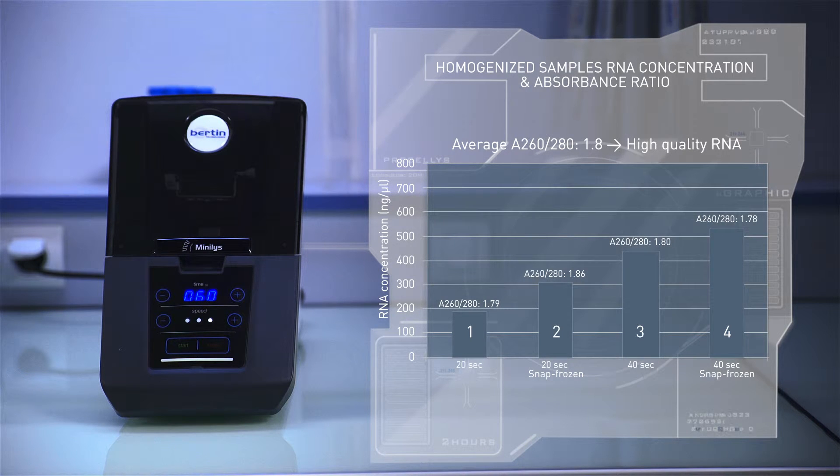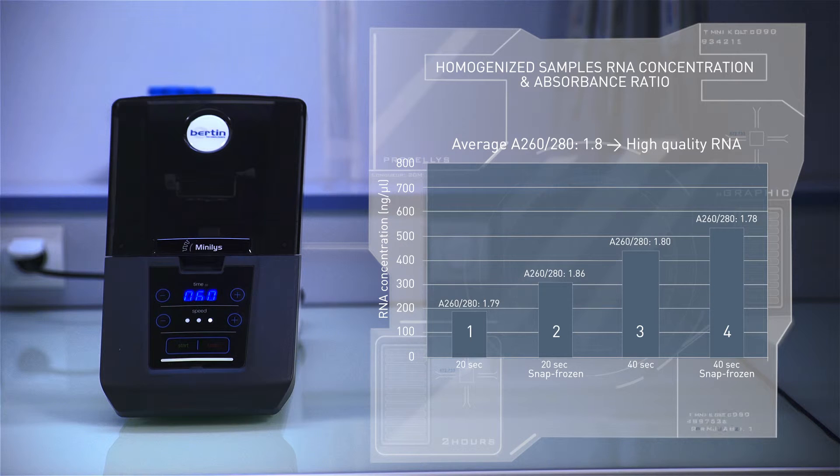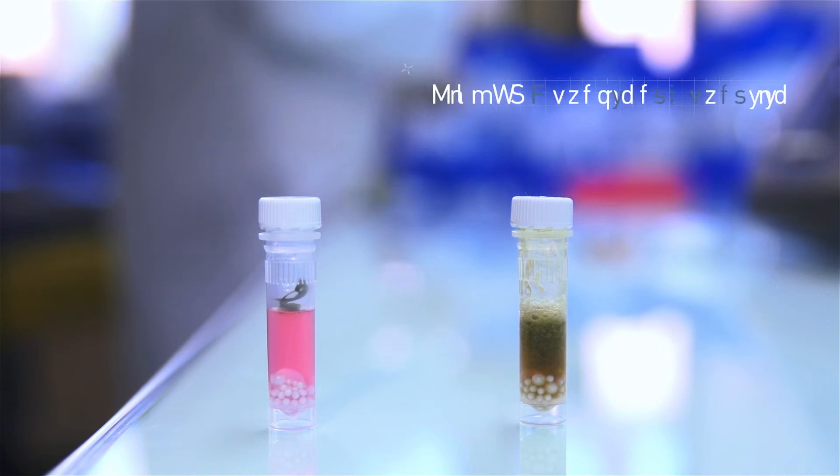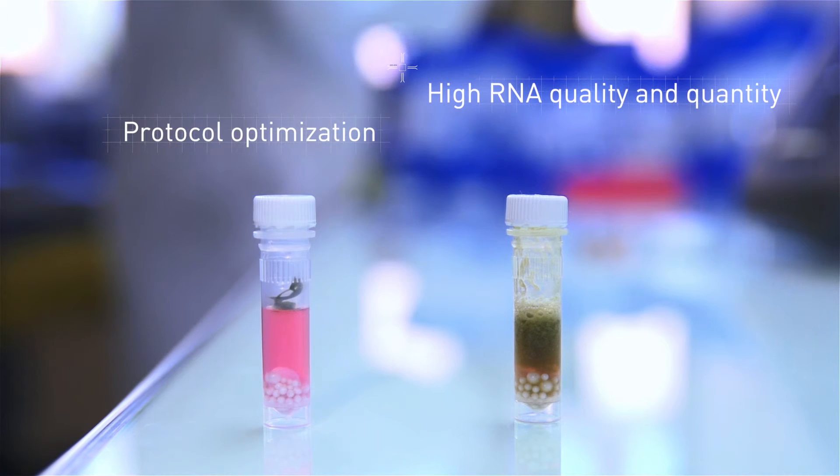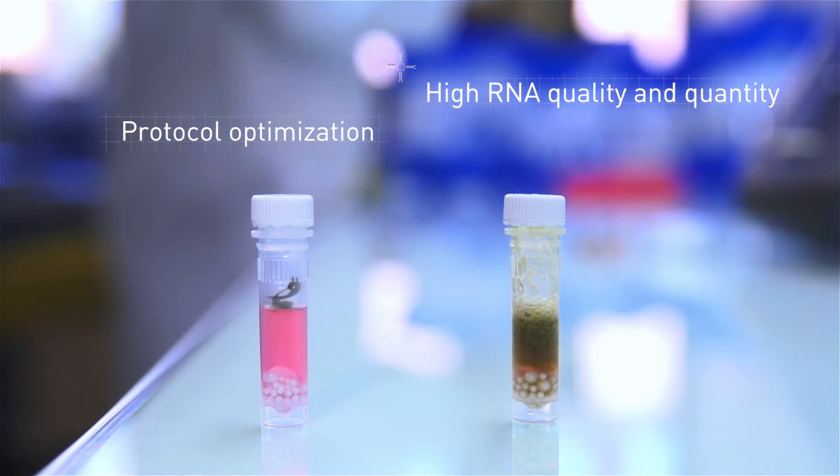After mini list homogenization, the IBMP team observed high RNA concentration and high quality extracted from Arabidopsis samples. In addition, an optimization of the protocol is possible by increasing the time per cycle on the mini list to improve the results.